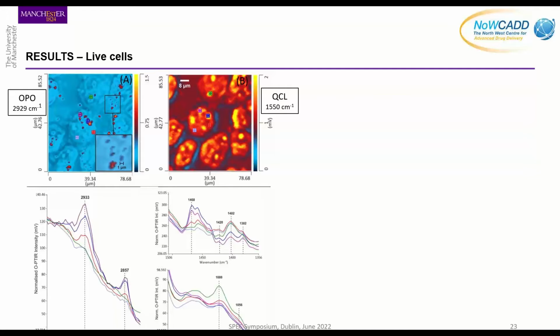And we can, again, in our system, that's sort of about 1 micron. We can see things that are slightly smaller than that, so it's reasonably consistent with the 0.5 micron spatial resolution, which is pretty good. And this is in water, so that's the amazing thing that I have to keep telling myself. This is in water, so it's quite special.